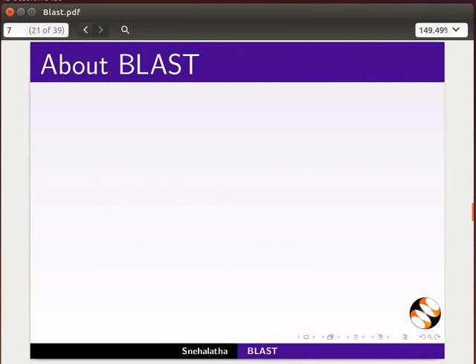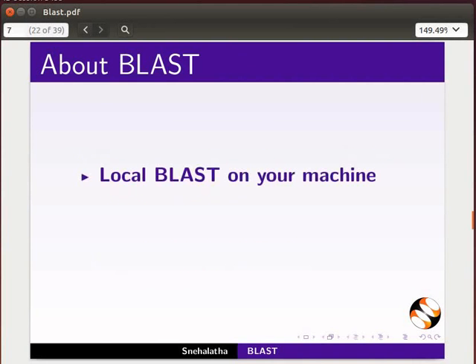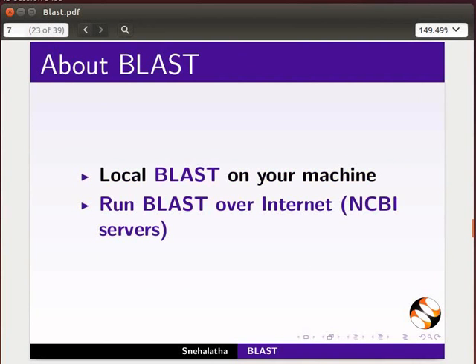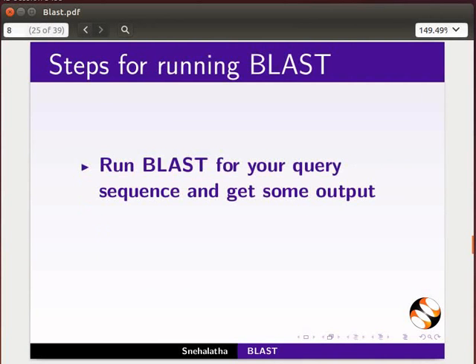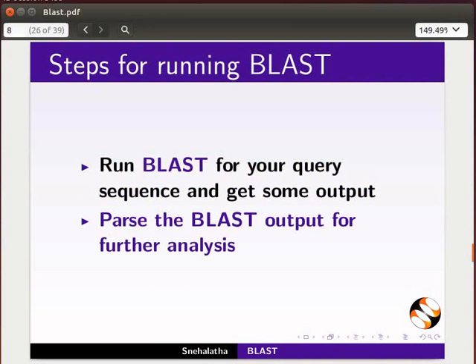There are two different ways to run BLAST: local BLAST on your machine, or run BLAST over the internet through NCBI servers. Running BLAST in Biopython has two steps. First, run BLAST for your query sequence and get some output. Second, parse the BLAST output for further analysis.